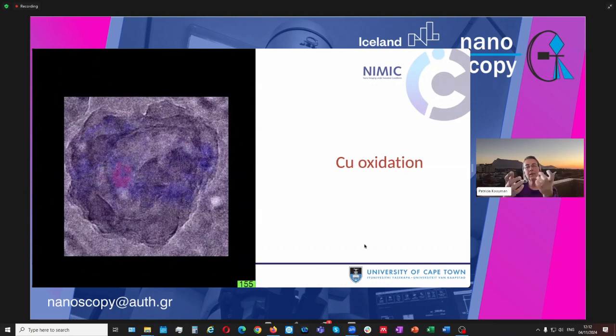The mechanism, as I said, was already postulated by Kirkendall: the copper atoms diffuse along the grain boundaries in the copper oxide, and as soon as they hit the outside atmosphere where there's oxygen available, they are oxidized to copper oxide. That is how you see this irregular shell growing, because the growing points are along the grain boundaries in the oxide shell.